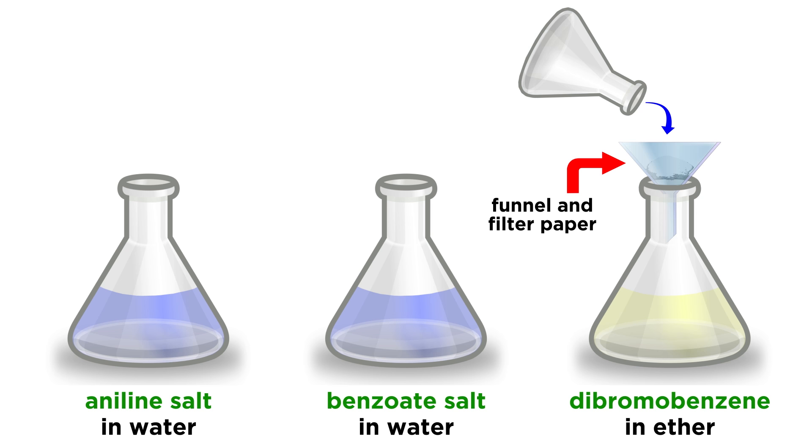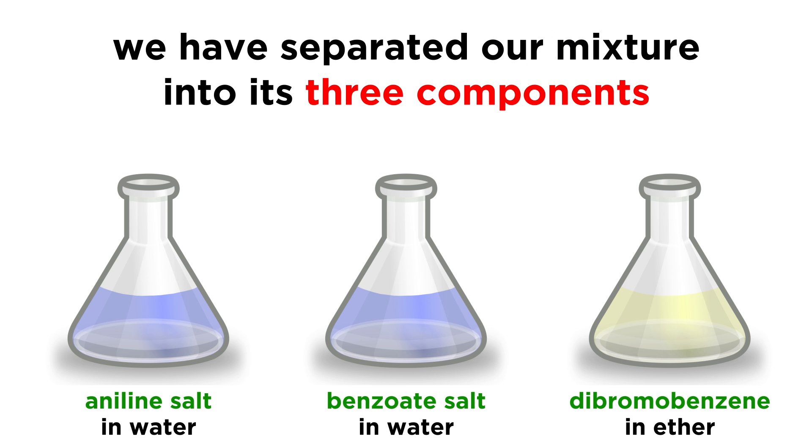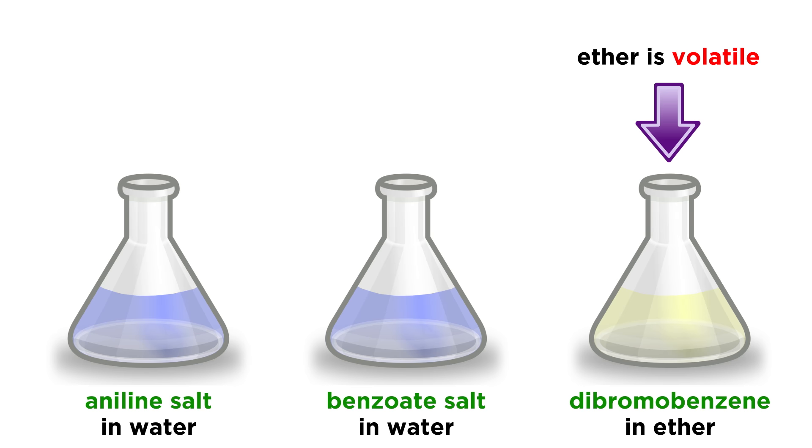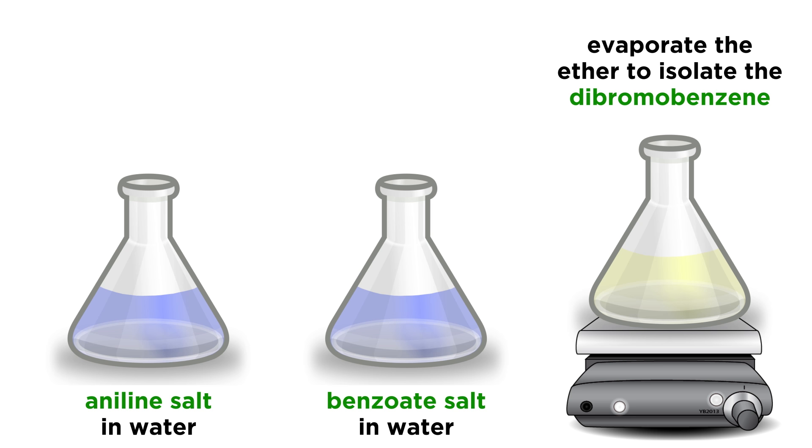Then use a funnel with some filter paper to transfer the solution into yet another flask, this time pre-weighed if you intend to measure the mass of product. So now we have successfully separated our mixture into its three components. So how do we get the solids back? Well, the dibromobenzene is easy. That's just sitting in ether, and ether is quite volatile, so let's just put it on a hot plate and use a low setting to gently evaporate the ether away. The dibromobenzene will remain as a residue, and you can weigh the flask again to get its mass.